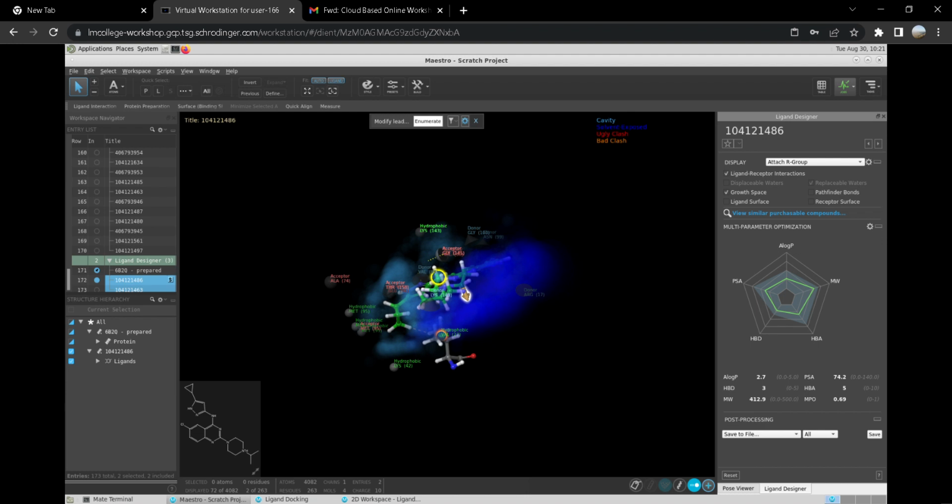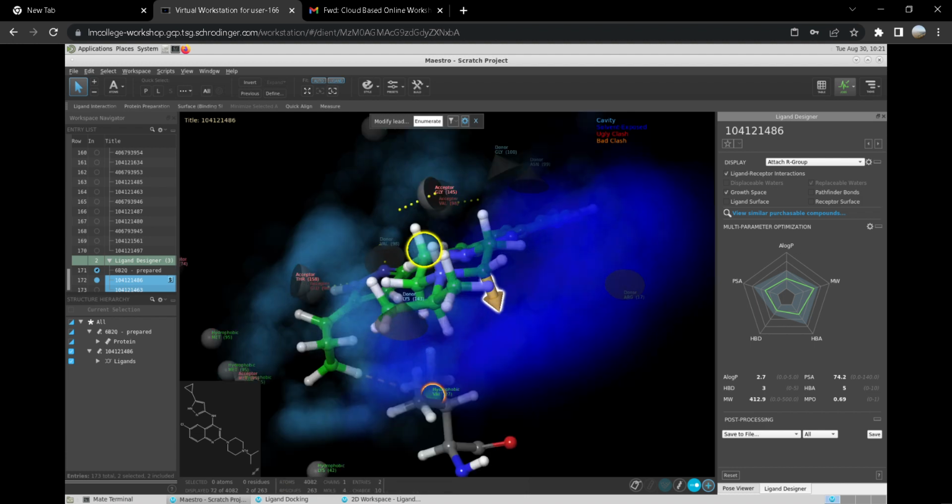And also don't be worried about these molecules that have a score of 10,000. That's more like the software somehow tried to fit the molecule. But 10,000 is a very high docking score, so those molecules are not going to be appropriate anyway for interacting with your protein. So in this case, I did not find any other fragment that can make the molecule better. But in your own projects, you might be able to go for those optimization things. And for every change that it makes, you can see how the Lipinski rule of 5 is going to be affected for your molecules.